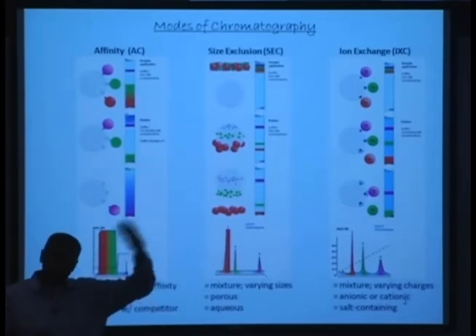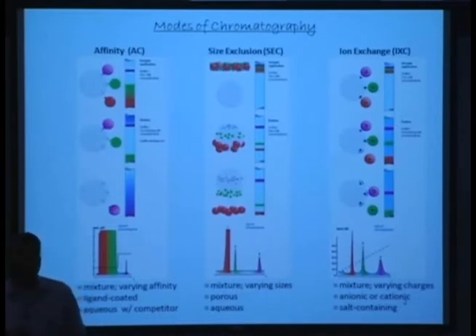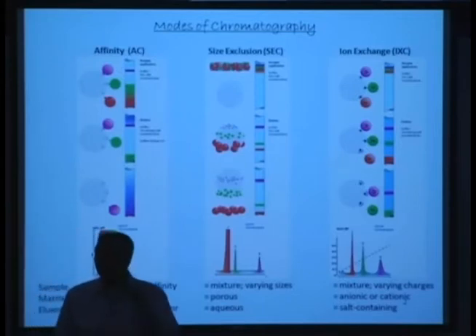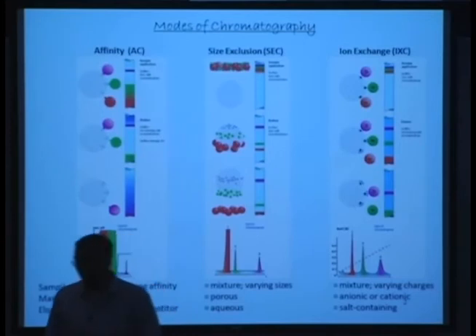So you're comparing unsulfated dextran with sulfated heparin, then the correlation will not be very good. Okay? There will be a systematic drift, and therefore you might be way off. So you have to use an appropriate control; you can use dextran, but then that has to be sulfated. Okay? Because the hydrodynamic volume is going to be significantly different.